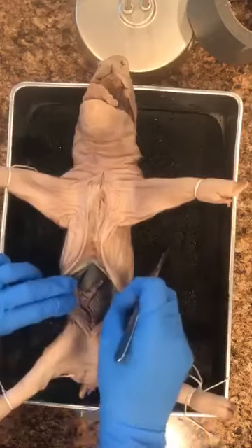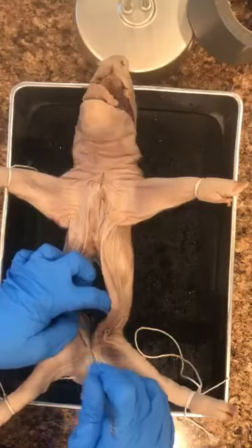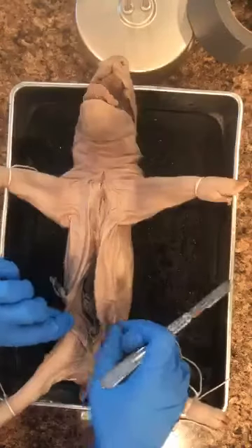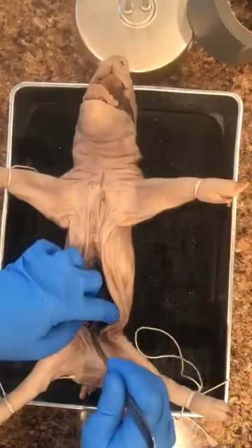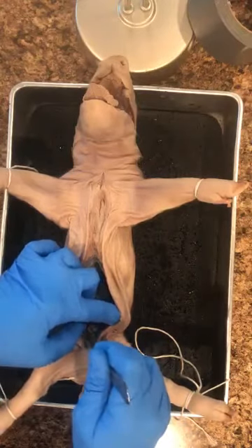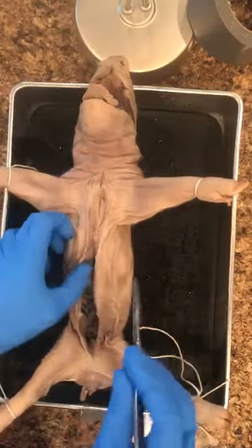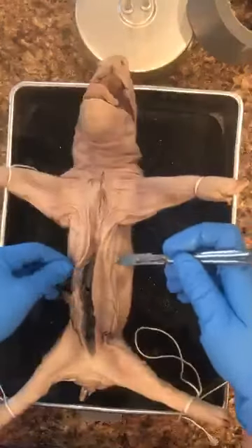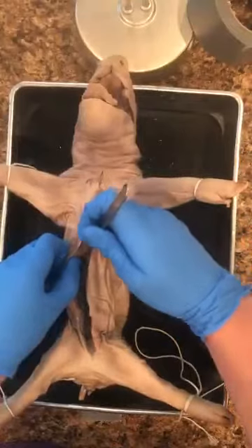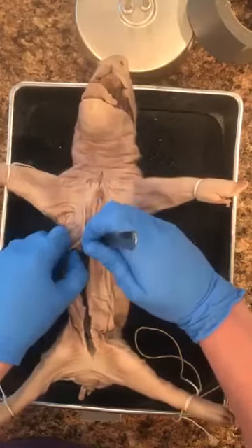Okay, you see some things? I'm gonna have to go dump out. This sounds gross, but I'm gonna be realistic here. I have to go dump this pig out because there are preservatives on the inside, and so it's kind of soupy in there, and you won't be able to see everything because there'll be liquid in the way. Okay, extend this up here.